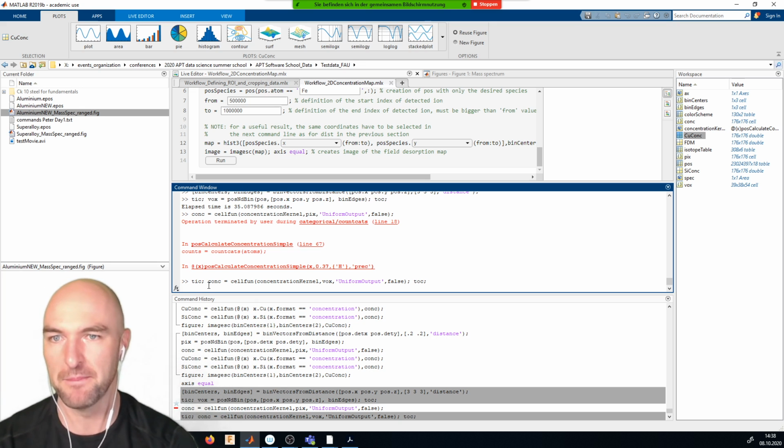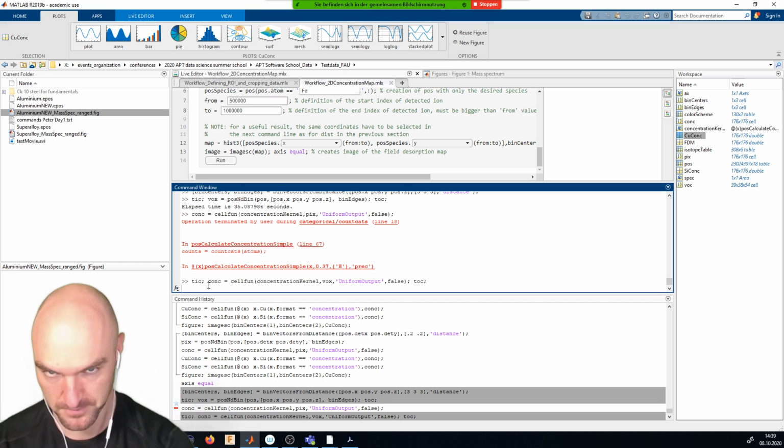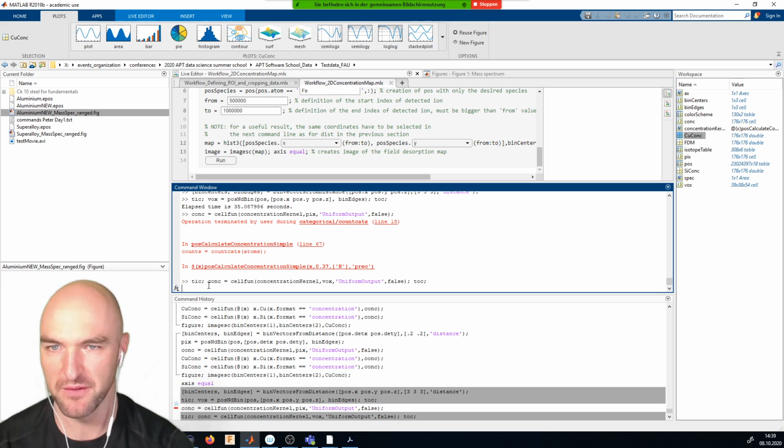And you can, for example, try a calculation on your POS file with 50 different settings, 100 different settings, and have all of those CPUs crunch each one of those parameter sweeps individually. But if I can have a wish from MathWorks, it would be that those cellfun and arrayfun functions really would be parallelized. That would be very, very helpful.